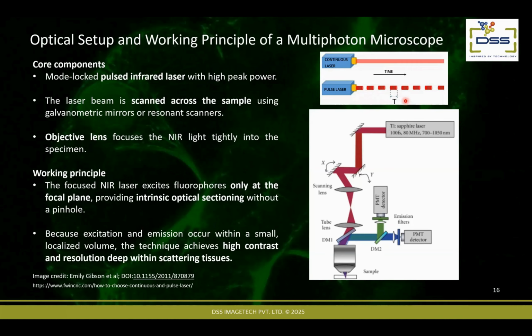And because of these pulses, since this two photon excitation can also result in very high heating of the sample, because it's IR light, the peak power that you achieve at your focal point is around 100 kilowatt. So that can cause heating, and that can also damage your sample. So that is why this light is not sent continuously, but in pulses. And then you can modulate the frequency of these pulses to make sure that you can do fast imaging.